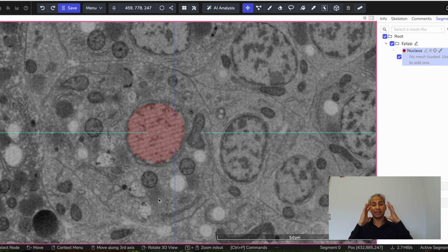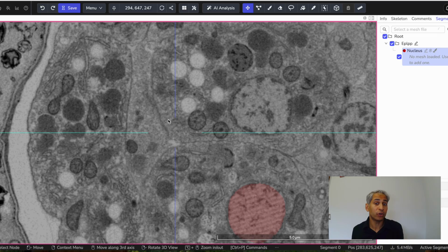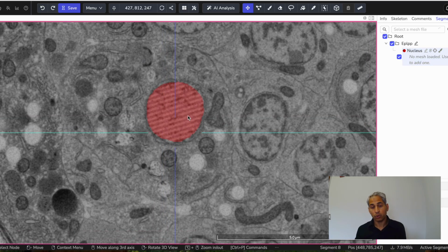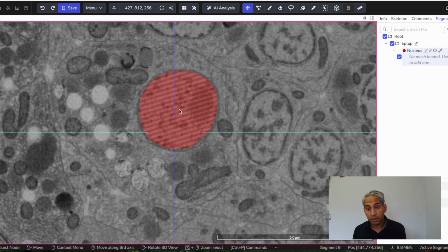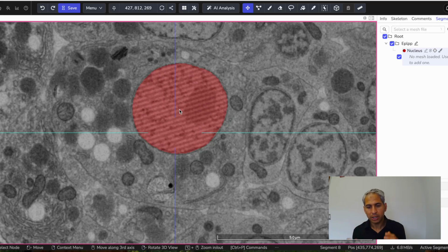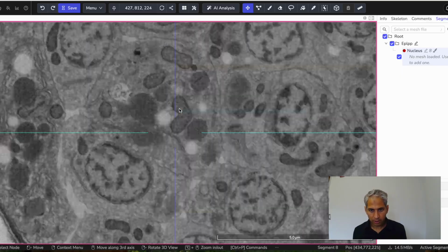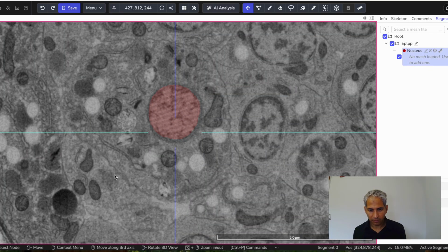In my case, my cell is pretty much contained. Some of you have cells that spread. The same cell has a spread, so you have to chase it along your screen by recentering your screen and chasing it, especially the hypodermal cells when they have this property, or the seam cells, I think. Maybe even the neuron cells. But the gut cells, they're like blocks. And so it's easy to see the boundaries, more or less, of my cell.